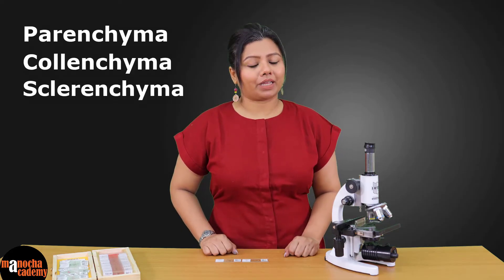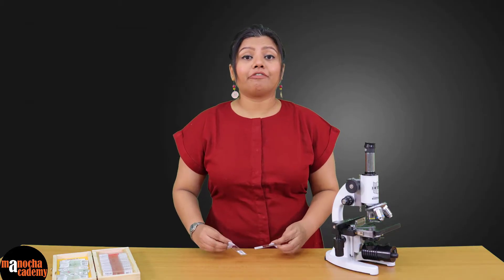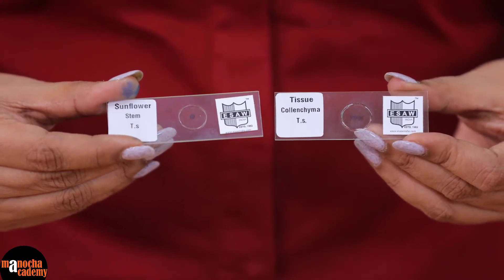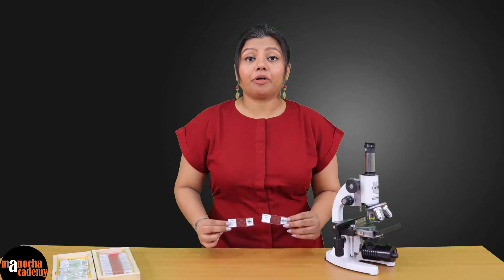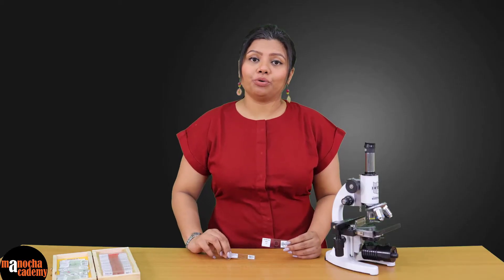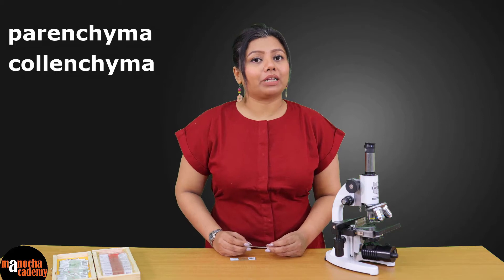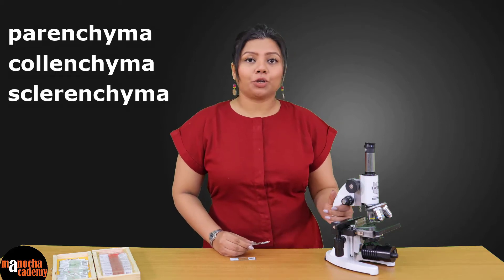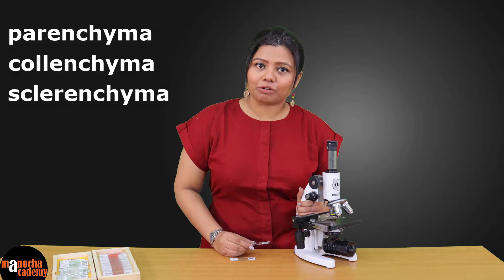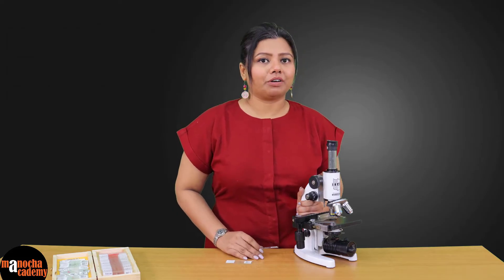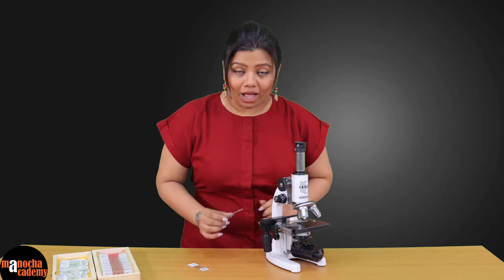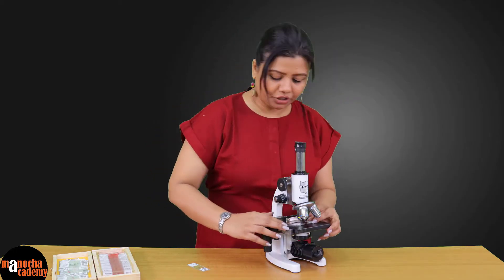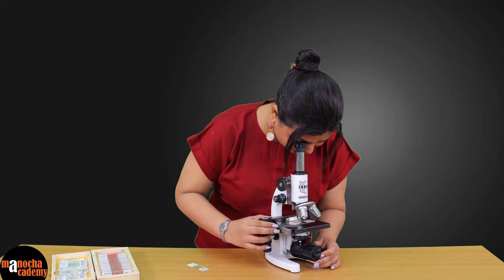For that I have two prepared permanent slides of the tissues, and I'm going to show you where the parenchyma, colenchyma, and sclerenchyma are. We will be needing a compound microscope. I will place the first slide on the stage and adjust the light of the microscope to focus the cells.